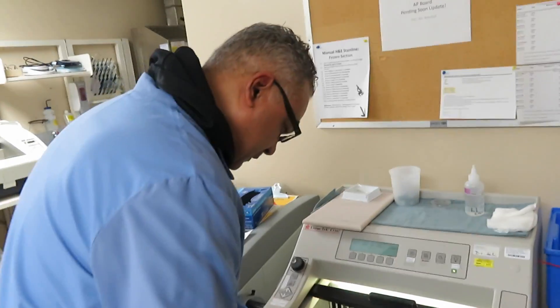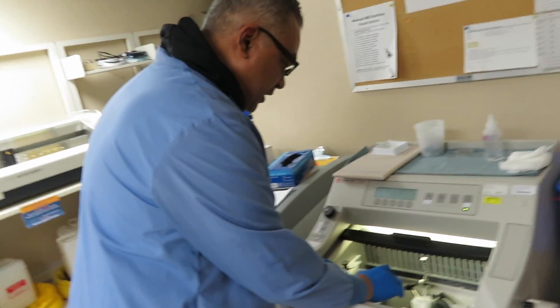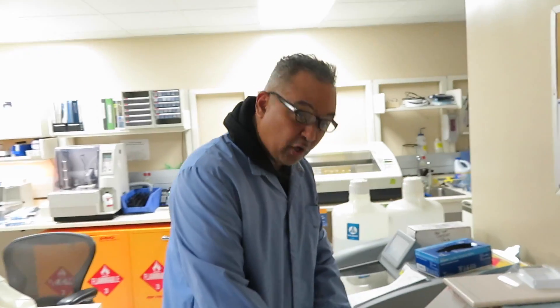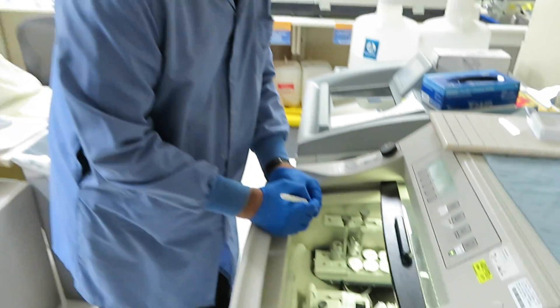We're done with the frozens. After we finish, we put the block in the cassette, close it, and wash out the OCT compound with warm water, then process it as a paraffin block. One of the things we don't want to do on social media is share any patient information or identifiers.